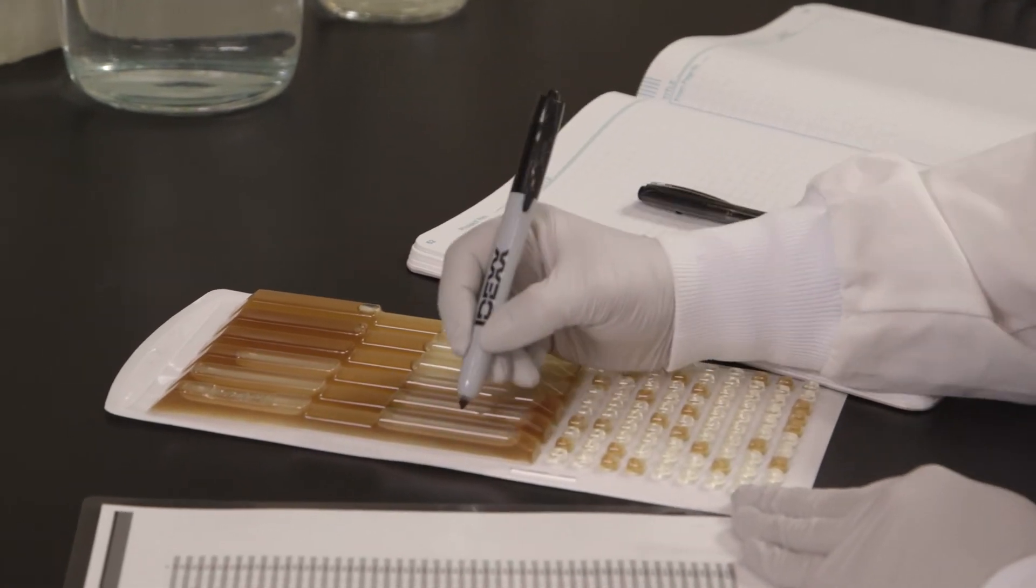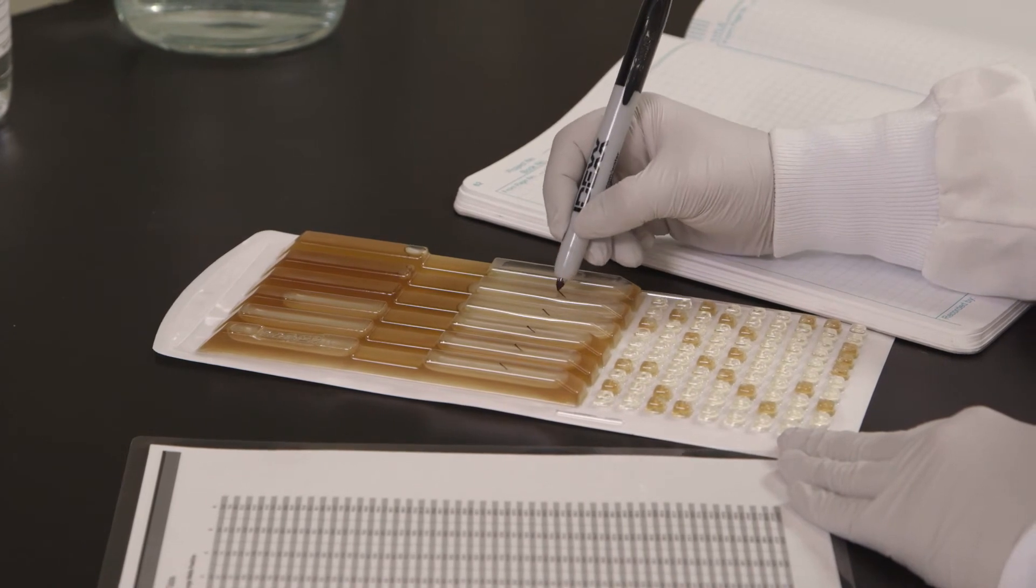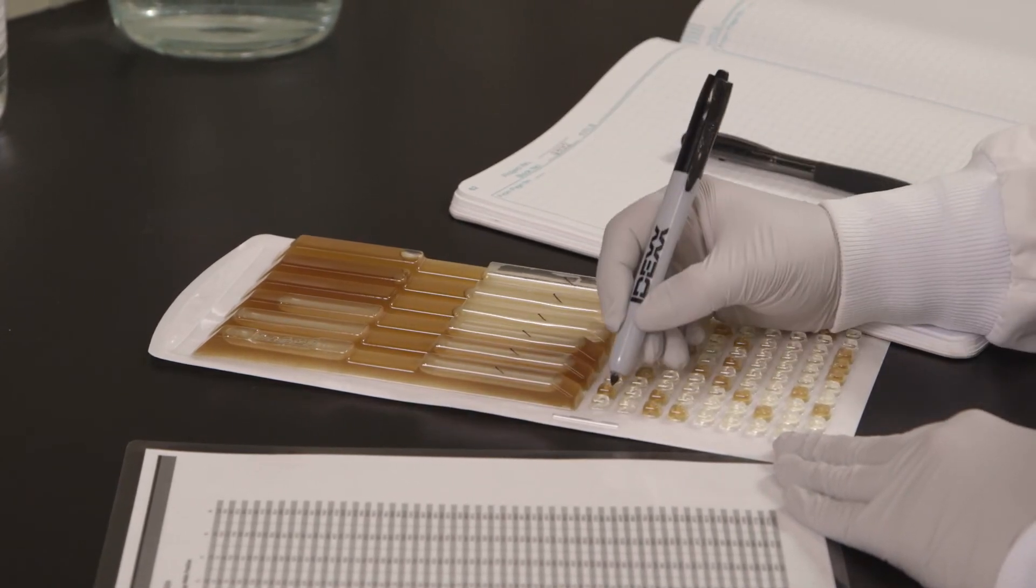After incubation, look for any indication of brown color and or turbidity greater than the negative control which indicates a positive well.